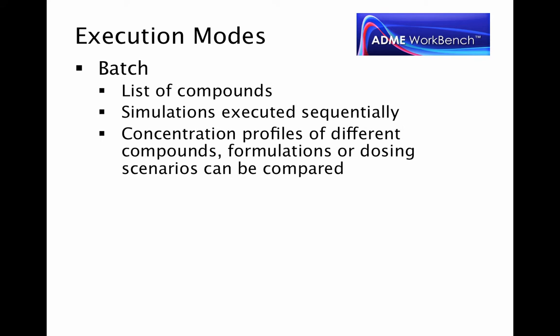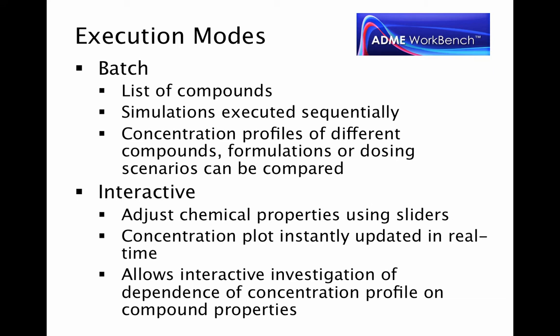Analyses in ADME WorkBench may be conducted in either batch or interactive mode. In batch mode, the analysis for each compound is a list, and the list is executed sequentially, and all results are presented at the end of a run, allowing PK profiles and results to be compared between compounds in the list. In interactive mode, a single compound is analyzed interactively, allowing you to manually adjust parameters and see the concentration profiles updated in real time.